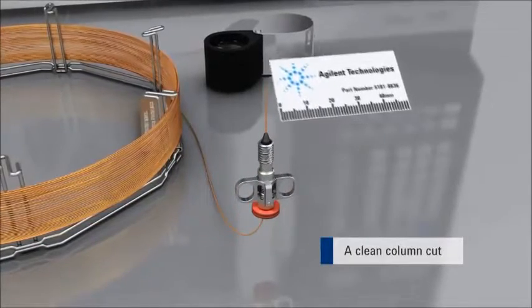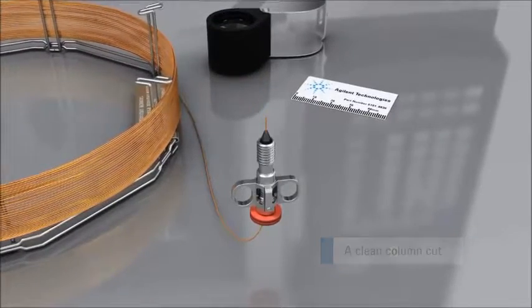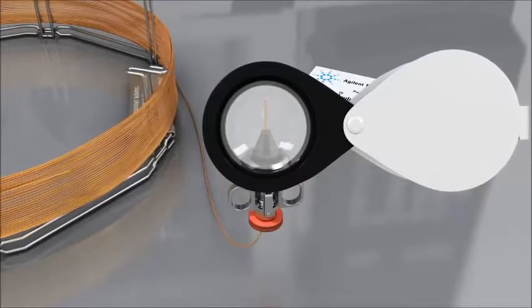Carefully trim the end of the column using a column cutter. Ensure the column cut is at a right angle to the tubing wall and that the end is free of chips, burrs, or uneven areas.